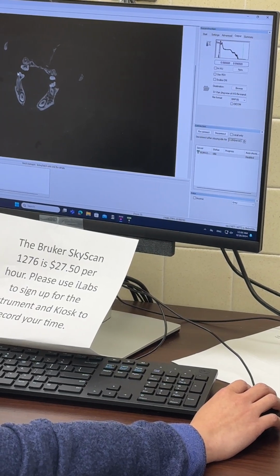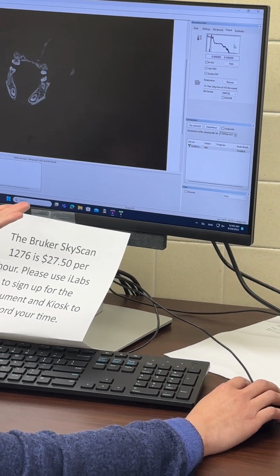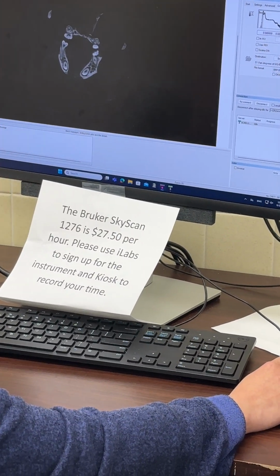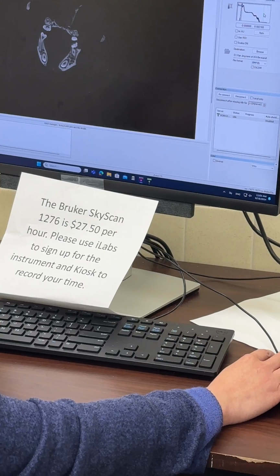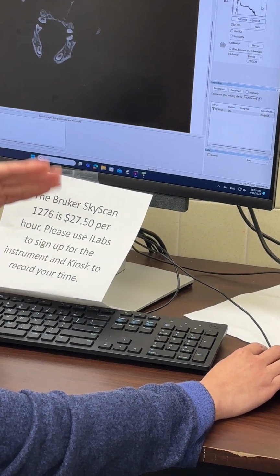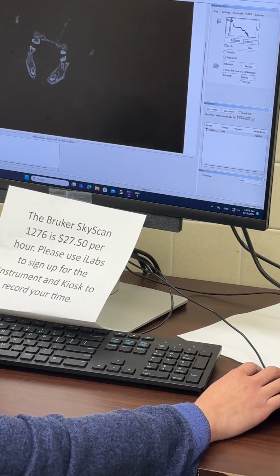Is it 0.09? Yeah, 0.09. The principle is if you feel more comfortable and you can see the difference between the control group and the other group. Ours is 0.09, but since I'm still adjusting, I can just move it around to see smaller details.